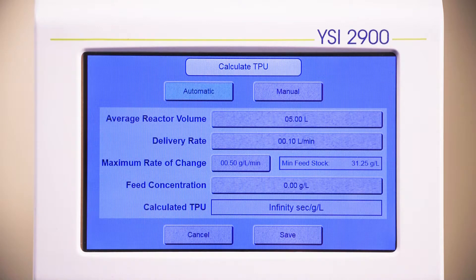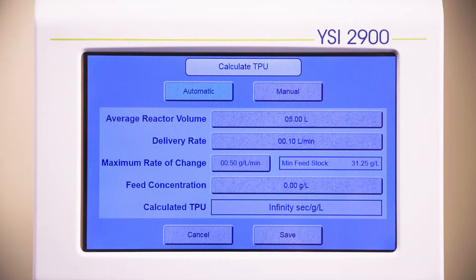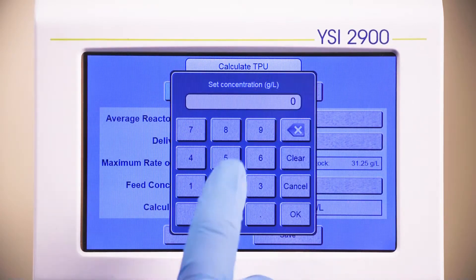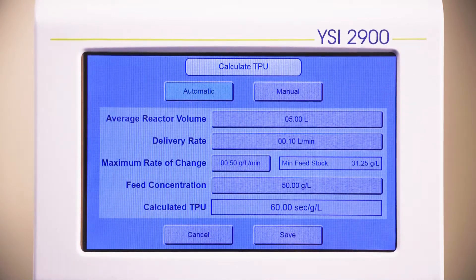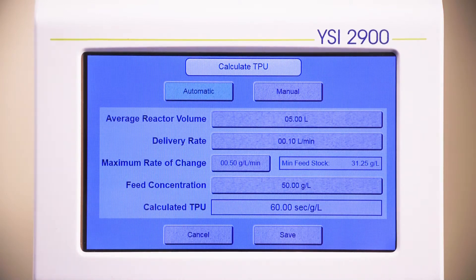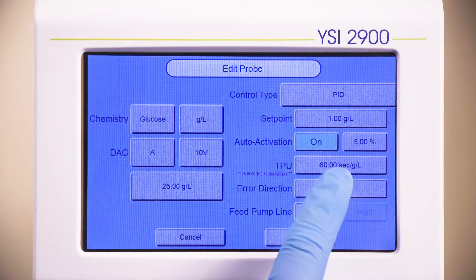The instrument will calculate the required minimum feedstock. In our example, the minimum concentration of feedstock required is 31.25 grams per liter. We will change the concentration of the feedstock to 50 grams per liter. Press the button next to Feed Concentration and enter the value of 50 grams per liter. The calculated TPU will appear on the last line of the page. Ours is 60 seconds per gram per liter. Press Save and the TPU now appears on your screen.